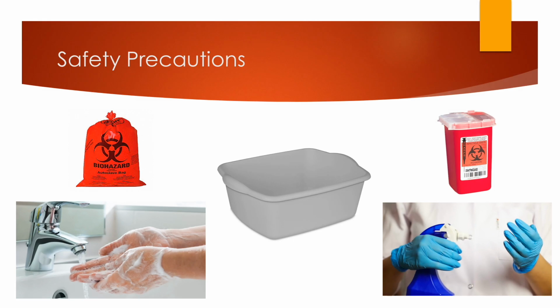Before beginning this experiment, there are some extra safety precautions needed since E. coli is a biological agent. PPE should always be worn when working with the bioreactor. When leaving the reactor bench, you must throw away your gloves and wash your hands.